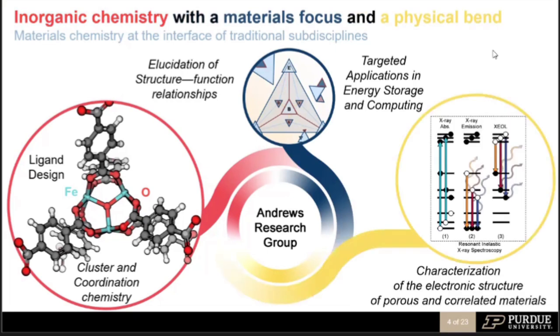But then, as you see today, this requires a lot of physical measurements. So for us, we want to impact the materials spectroscopy and all of the things that we do. As you see today, I'll talk briefly about how X-ray techniques have largely been limited to access to synchrotrons, right?